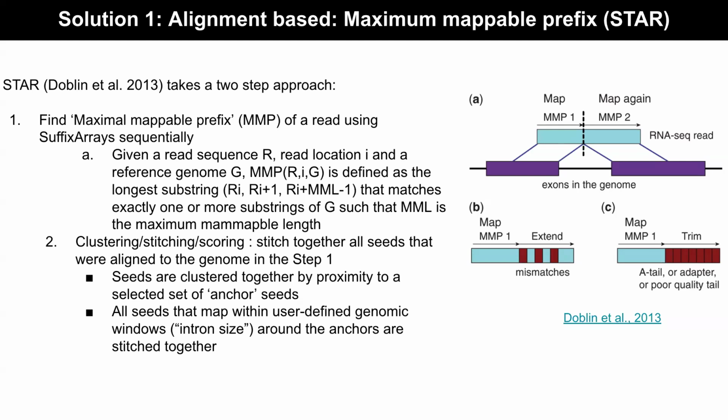How are we identifying a new isoform? So what we do is, again, we take our data. We take the paired end data that we have. So I did an experiment. Again, my kidney has some disease. I will take the data.